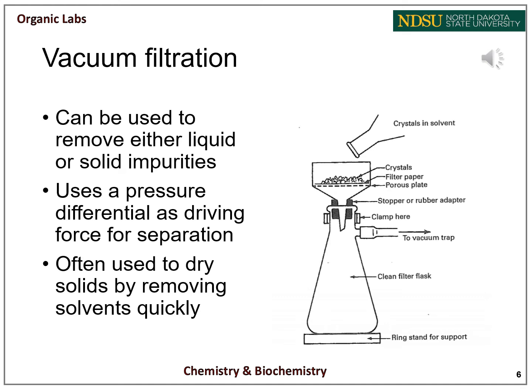The picture on the right shows a generic vacuum filtration setup. We have a heavy glass-walled vacuum flask which will be connected to the vacuum and a Buchner funnel placed inside of a rubber adapter that seals the flask. The vacuum is applied, pulling liquids and air from outside into the flask quickly. This removes the solvent from the crystals and also dries the crystals as air is constantly flowing through them.